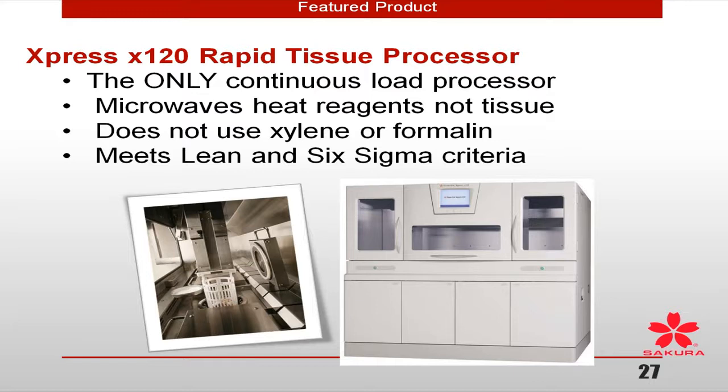So the Express does not use xylene, and the two products that are most commonly used, either the Dako or the Ventana, do have formalin fixation and xylene in their processing. You have to do a full validation protocol and prove that if you're going to use the Express without xylene, or even if you decide to change to a different fixative, that compared to samples run exactly as the FDA specifies, you can get a correlation. So I think maybe that's the other thing you were asking in the question.